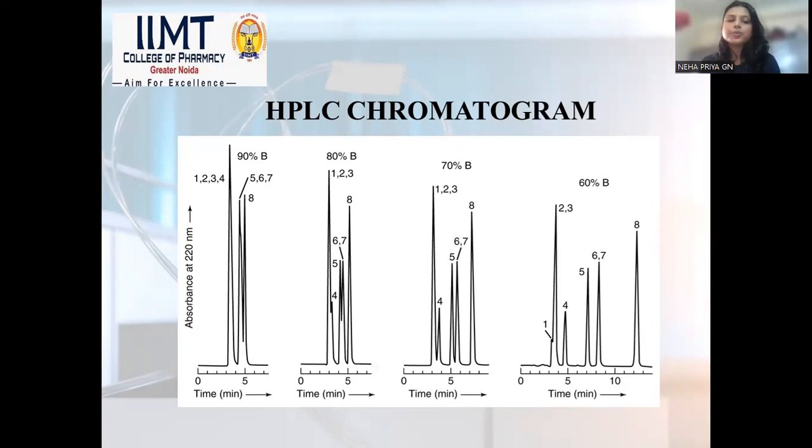This is the HPLC chromatogram. It is between absorbance and time. As I have already mentioned, the result will come within a time, and we need to learn about the standard time of certain compounds. Then only we can detect those compounds over HPLC.